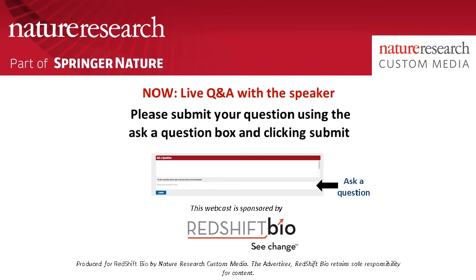So, our first question. Are there any buffers typically found in protein formulations that are incompatible with microfluidic modulation spectroscopy?